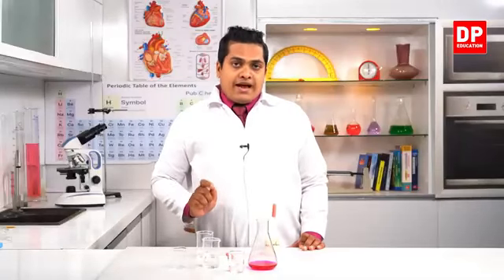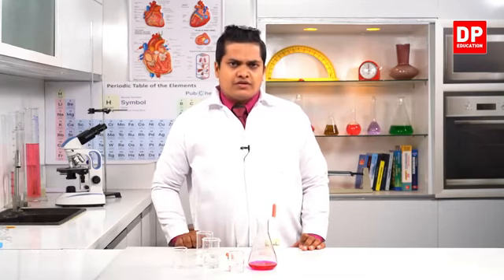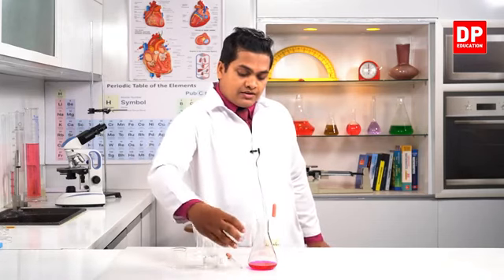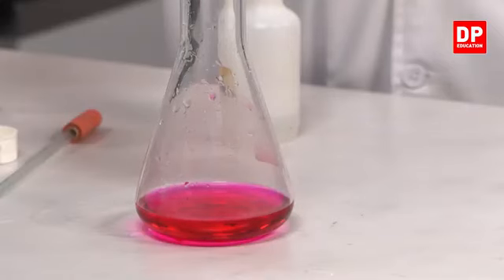Now, when I am adding this hydrochloric acid, at a certain point, if the solution is getting neutralized, if the basic features are disappearing, then this solution should become colorless, because phenolphthalein is originally colorless, right? So when adding acid, it should turn into a colorless solution. We'll see whether it is getting into a colorless solution or not. We'll add more. Remember to add it slowly, my dear children.